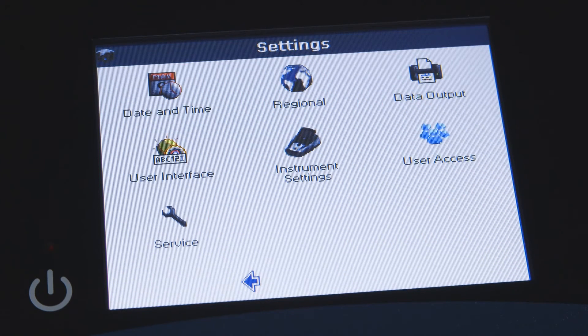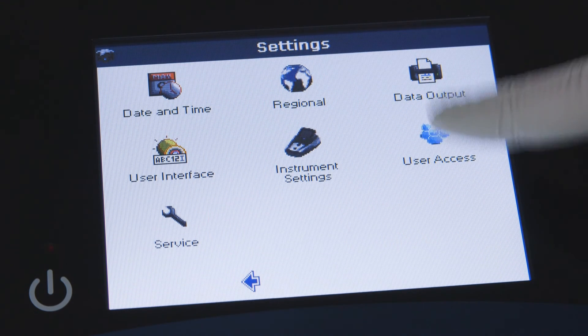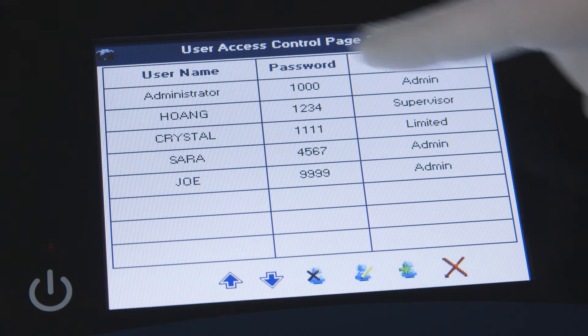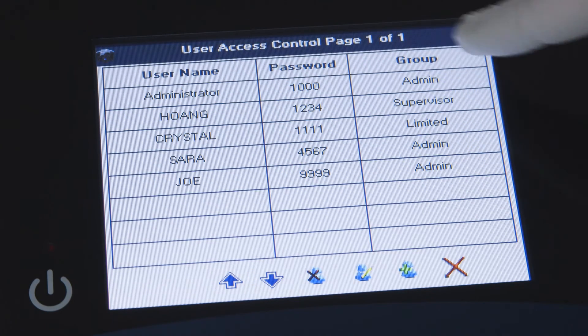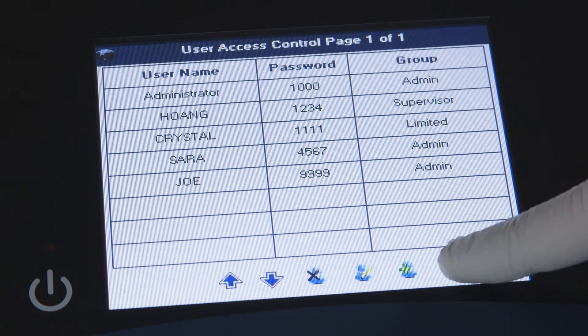In the user access menu option, you may add users and set limitations on software functionality according to the user group permissions.